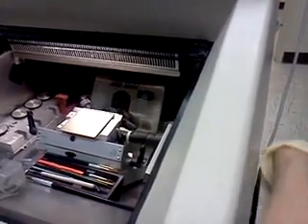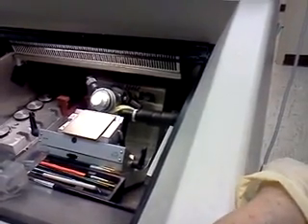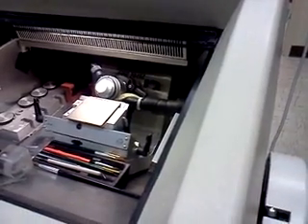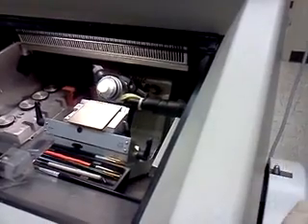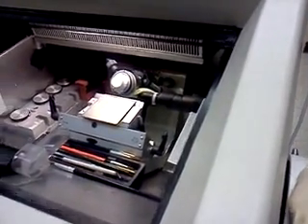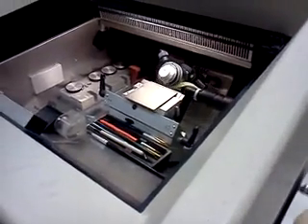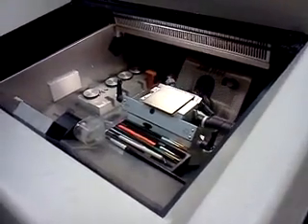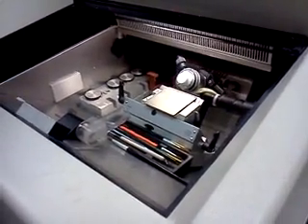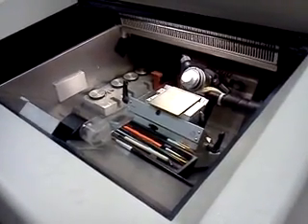This could go on for a while. This is where it'd be nice if we could motorize the trim and do it at 30 instead of 10, because it would come forward faster, wouldn't it? In other words, if I made it 100, it'd go really far forward. Every time you're advancing 100. And we don't care if we advance 100 because we're trying to get here fast.